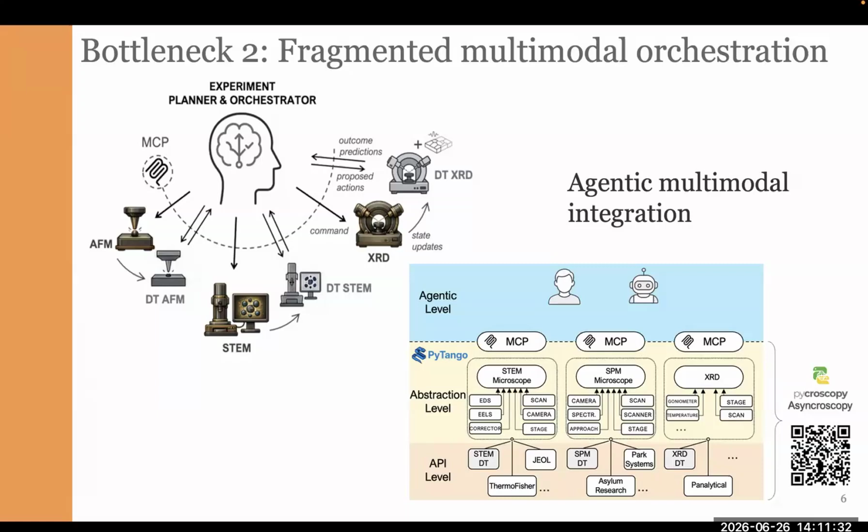And here I would like, again, to pay attention to the asynchroscopy project, which is devoted to the development of such an instrument vendor agnostic abstraction layer, which provides you, through MCP servers, control for the whole facility, for the whole instrument on the level of facility at least, and in the best case scenario even wider.